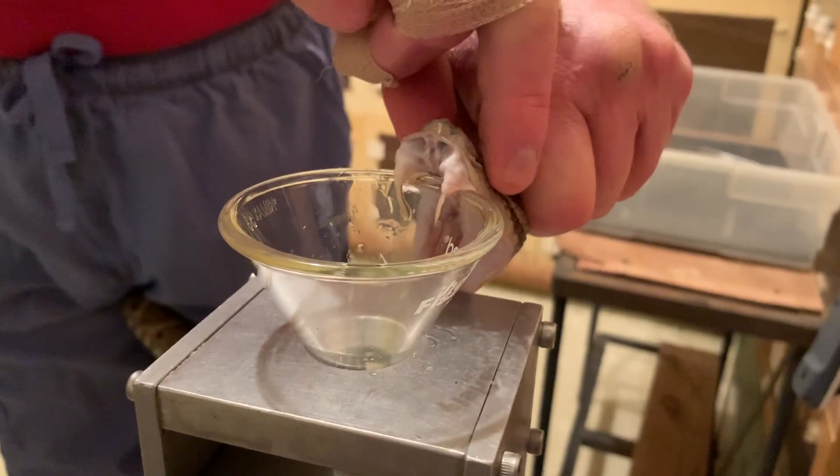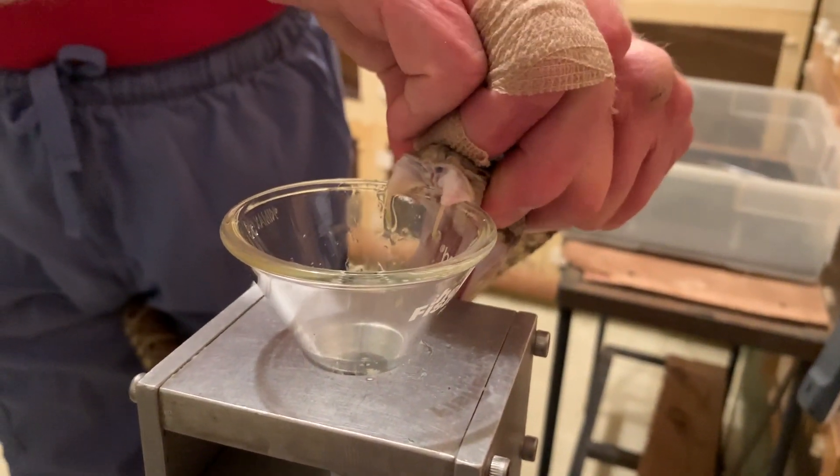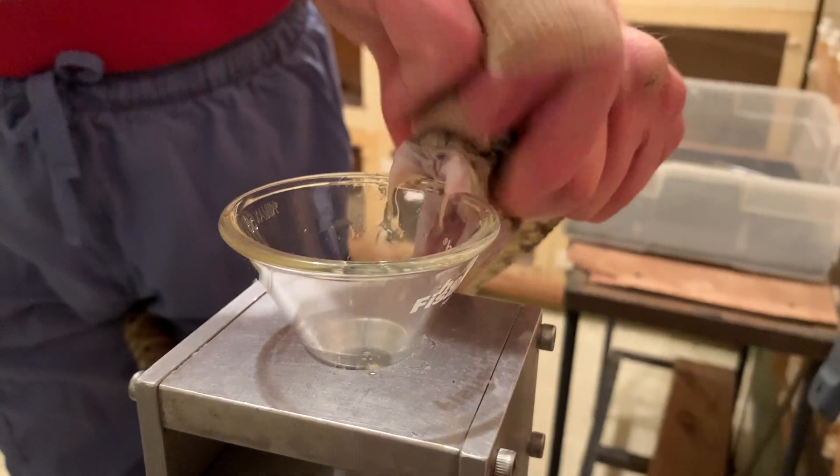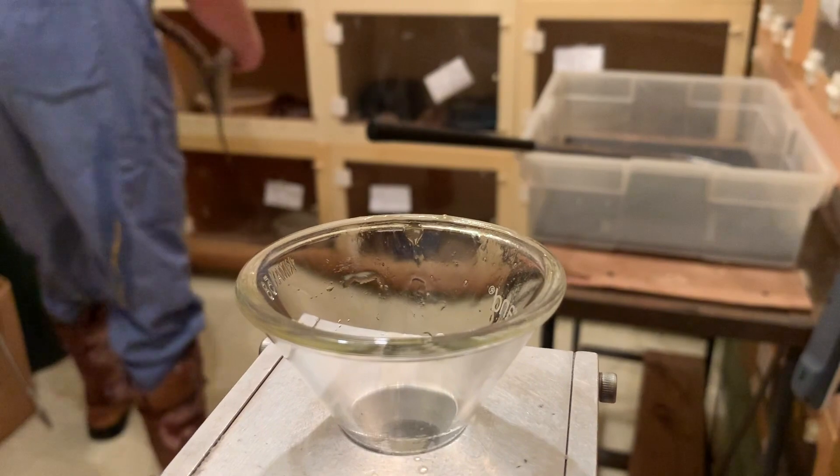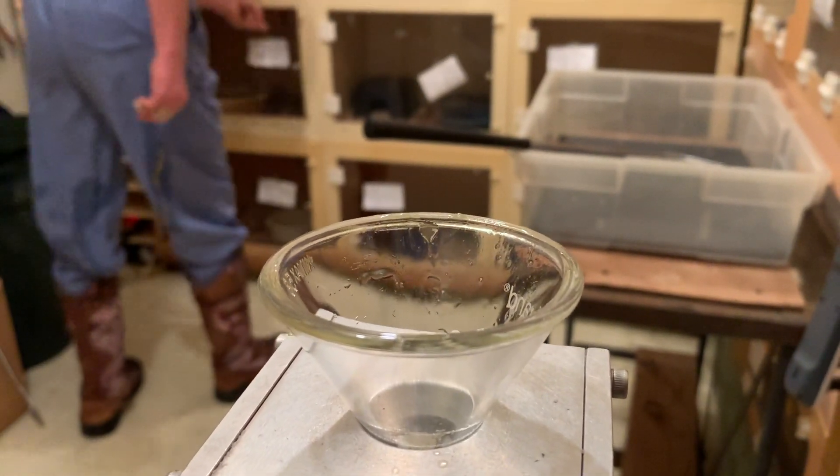Sometimes people ask us why we don't use parafilm. We don't use parafilm on all snakes, and you can see here why — because the snake can just easily hook its fangs over the edge of the funnel. There's just no real reason to waste a parafilm.